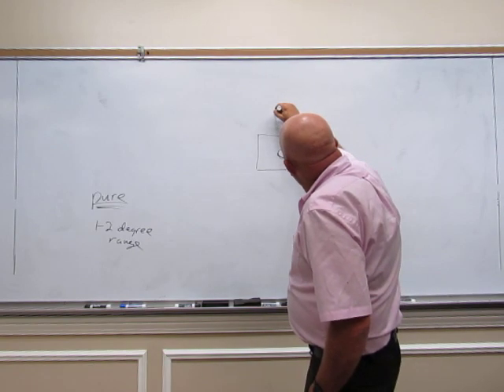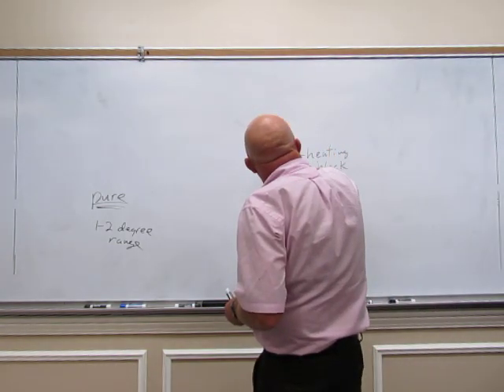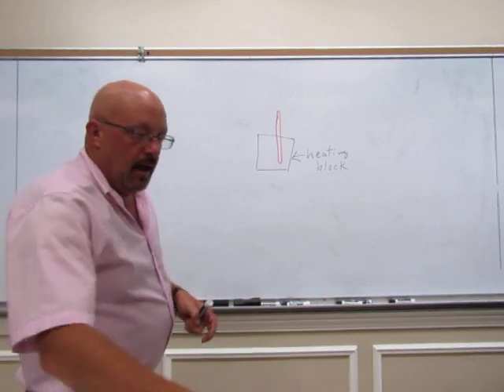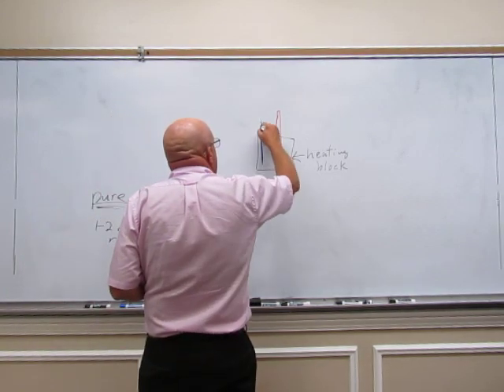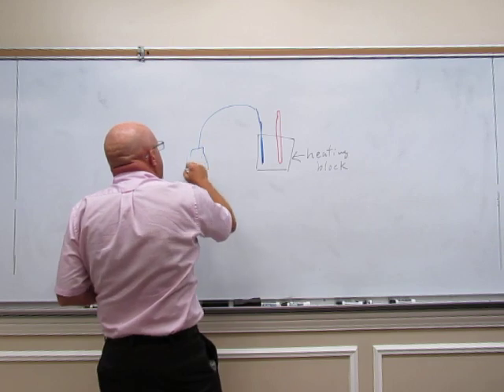And your capillary tube goes into that heating block. There's an opening there. You will see it when you get in there. So the capillary tube goes down into the heating block. And then here on the other side there is a thermometer. And this goes out to a digital readout.